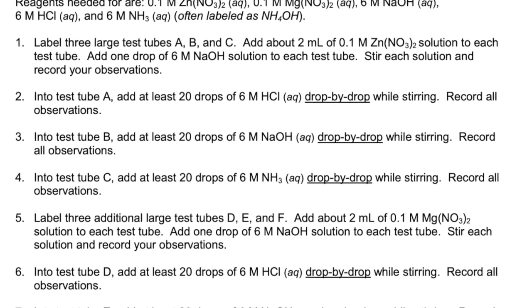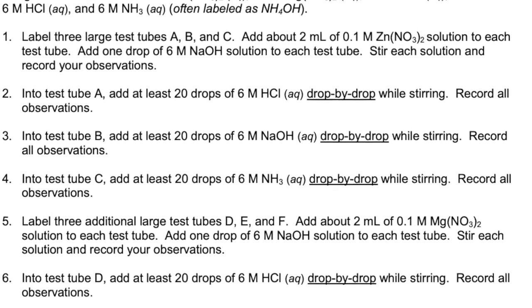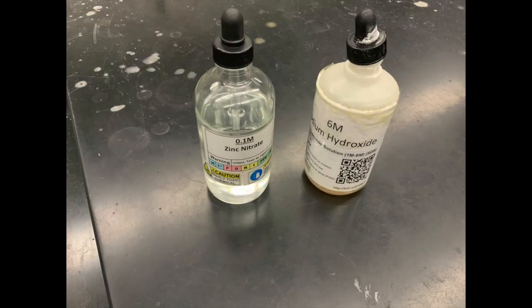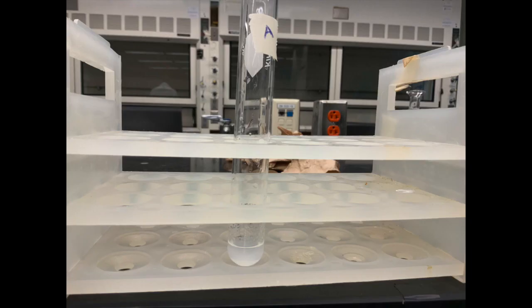We are now in the last part of the lab where we are investigating how we can use Le Chatelier's principle to help dissolve insoluble salts. We start by mixing a solution of 0.1 molar zinc nitrate with 6 molar NaOH in a test tube labeled A. Record your observation of the mixture. We make two more of these mixtures in two other test tubes labeled B and C. The test tubes are placed in a rack arranged from left to right as A, B, and C.